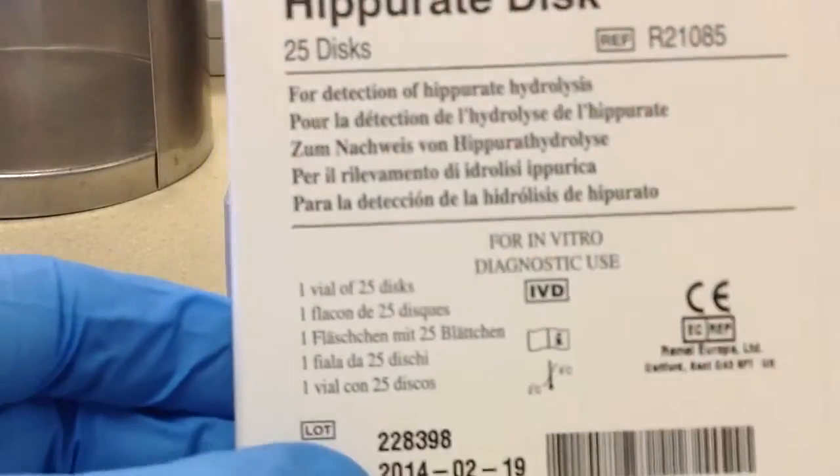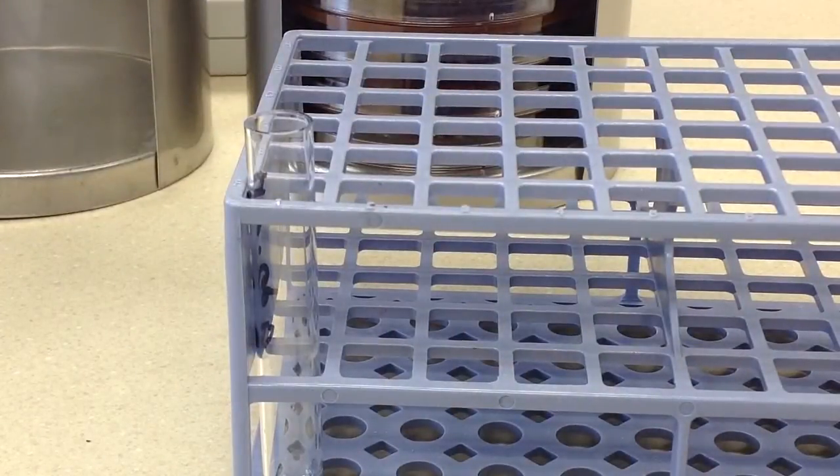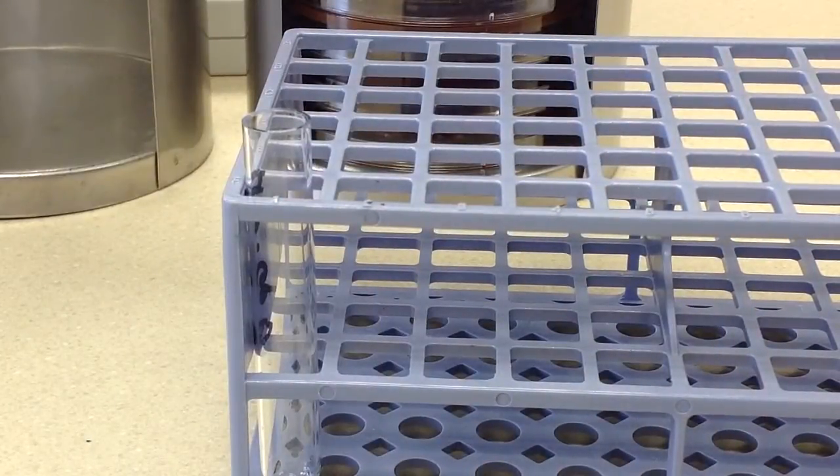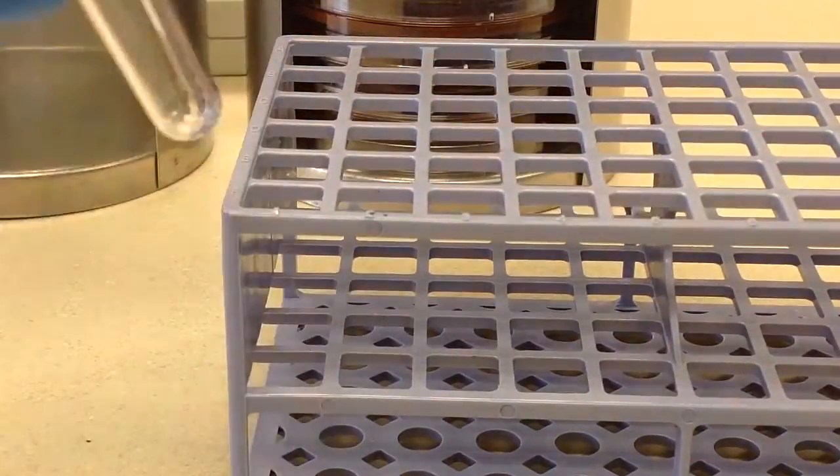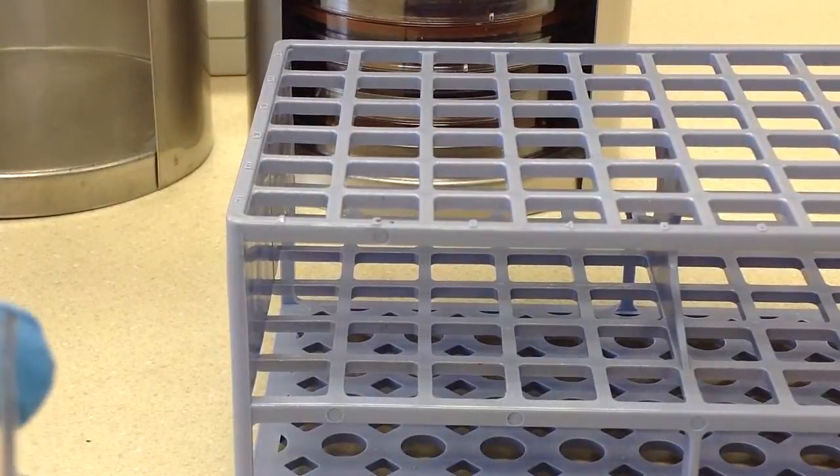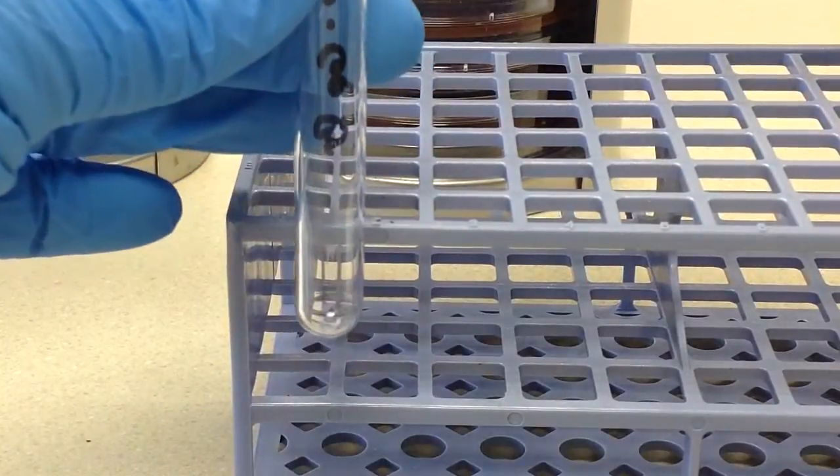We're going to be using the Remmel Hippurate disc, and we will eventually be adding the Remmel Ninhydrin Reagent. This procedure first calls for using a plastic test tube, and we're going to add 0.1 milliliters of DI water to it.